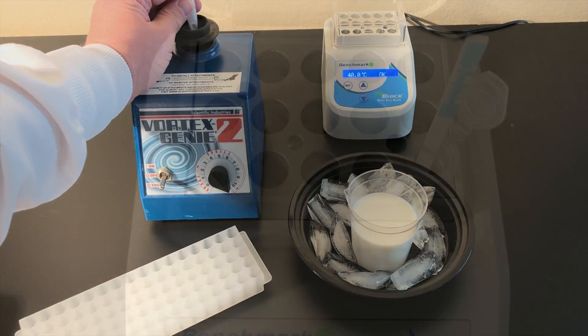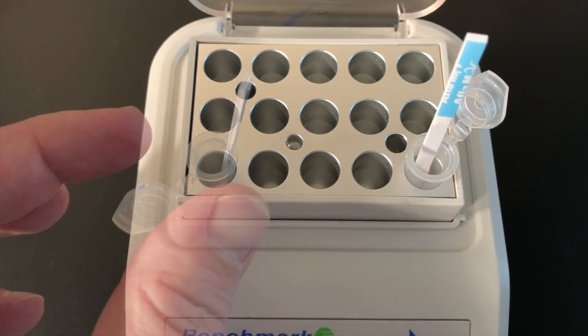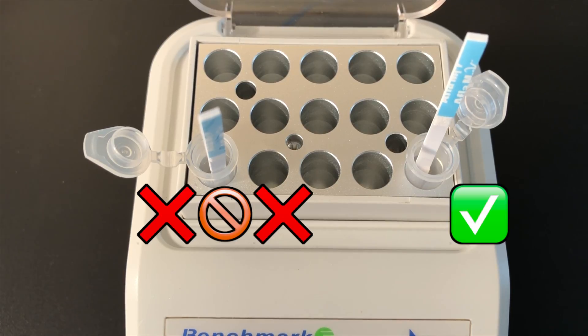Place the vial into the 40 degrees centigrade incubator and place an AFLA-M1V strip in the vial. The logo side of the strip remains outside the vial. Do not rest the logo side of the strip against the edge of the vial. The back of the strip should rest against the side of the vial.